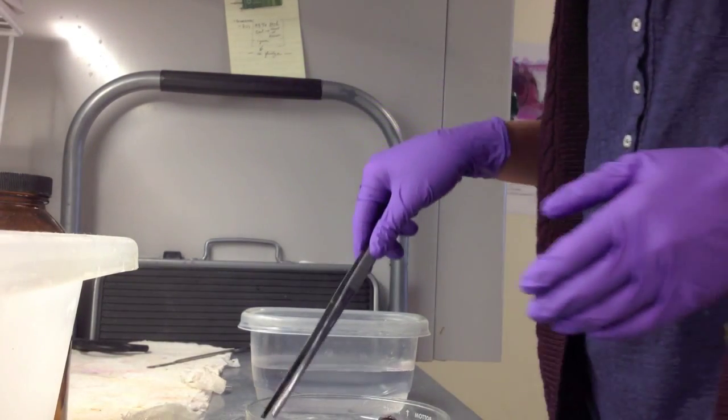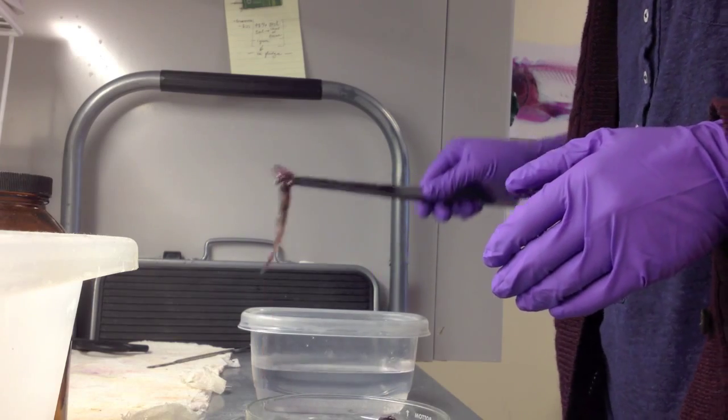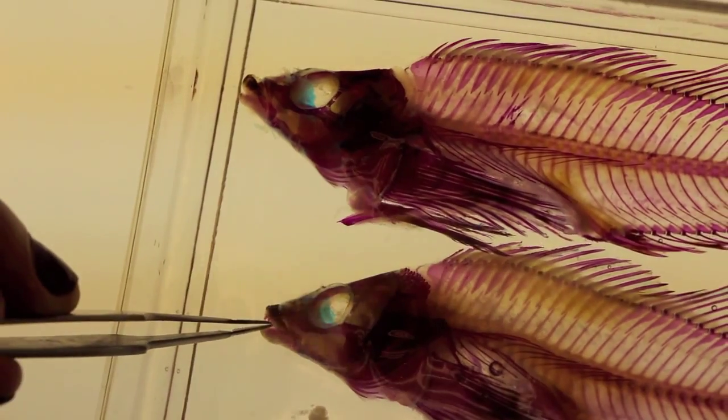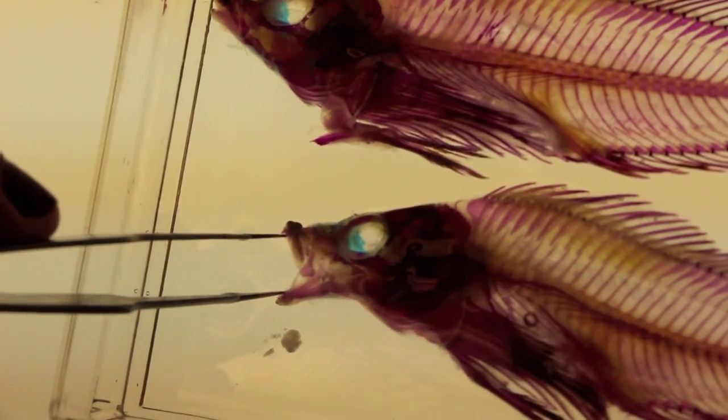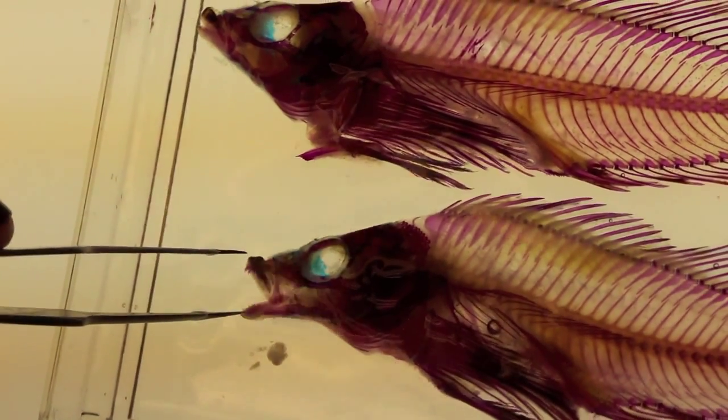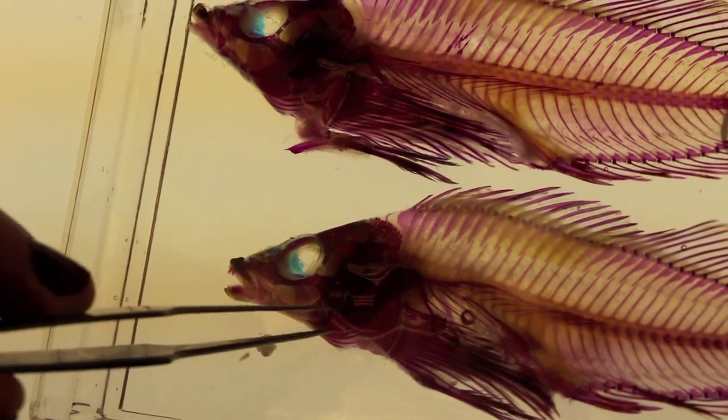Next, we place the specimens in 0.25 KOH for one day. The organism is then placed in glycerin for storage. As you can see, the specimens are easy to move, and the skeleton is visible. The cartilage is blue, and the bones are red.